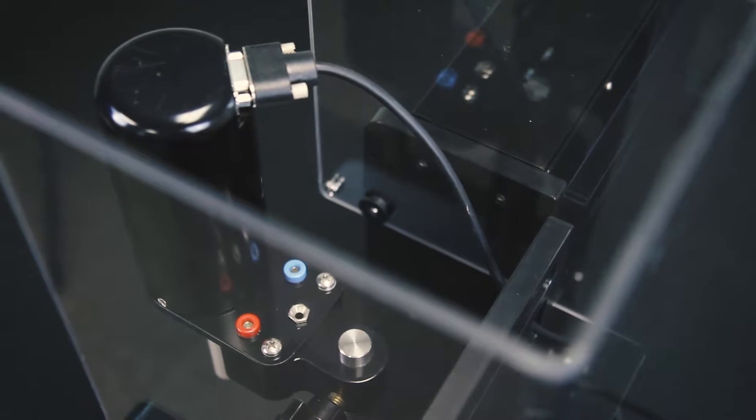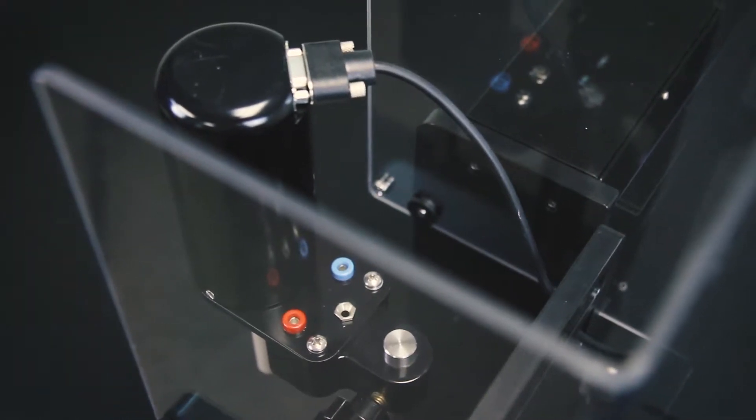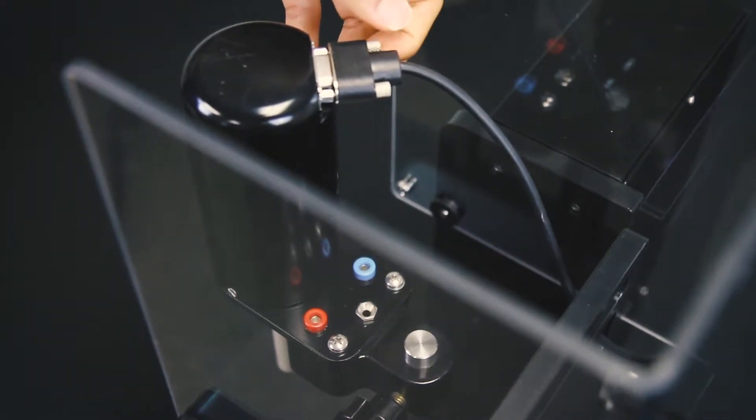Next, unplug the motor cable by loosening the two thumb screws and pull the cable out of the motor unit.